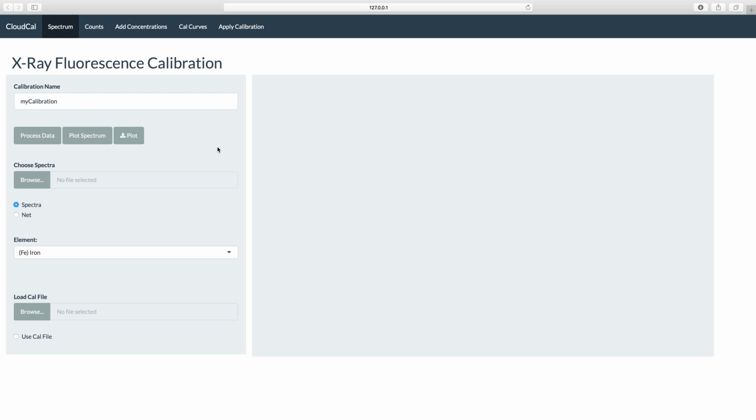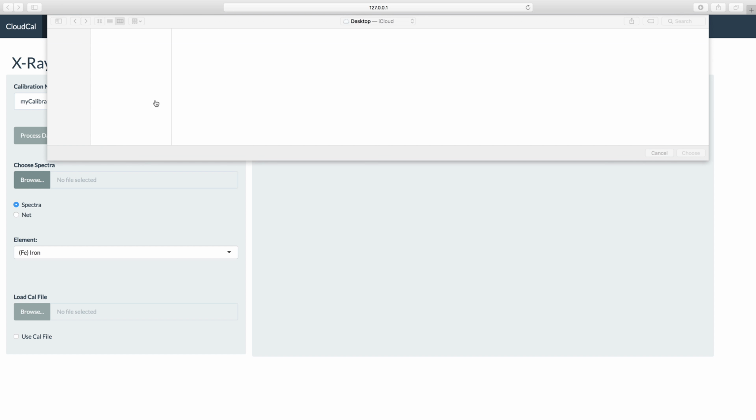The purpose of this video is to give you a quick introduction to the X-ray fluorescence calibration software that's available online. The base idea behind this is to use reference standards to form what are called empirical calibrations. What this means is that we'll use empirical standards to get quantitative values. The reason this approach is preferable to some is because the same corrections you do on one instrument can be applied to another, which can help make them agree with each other and help form the basis for both reliability and interlaboratory comparisons. Now, our first step is going to be uploading spectra.